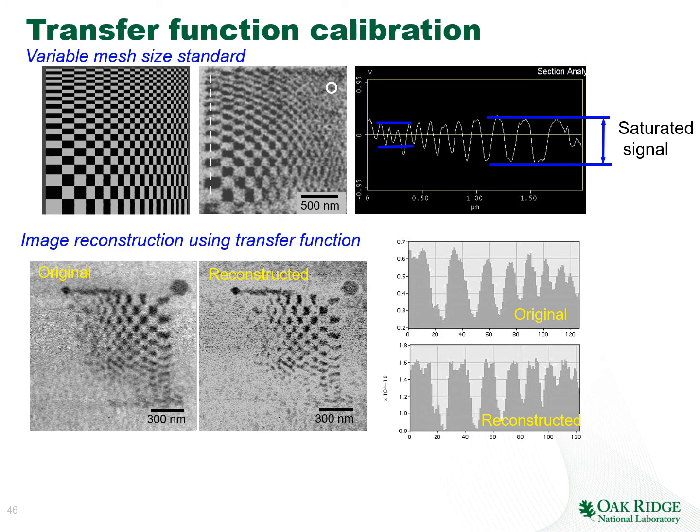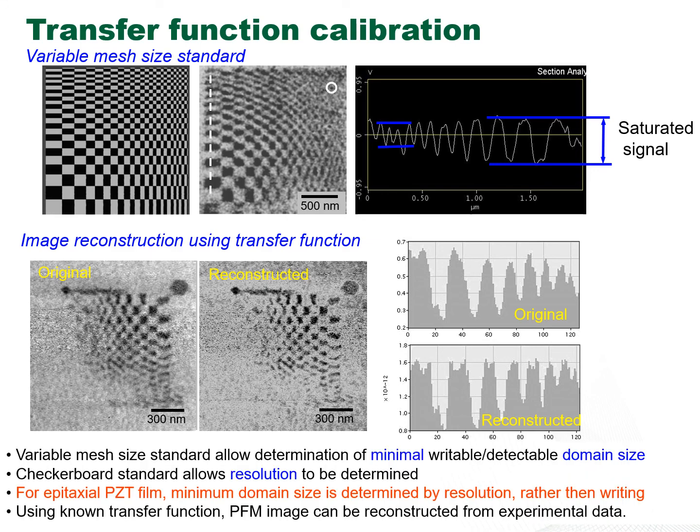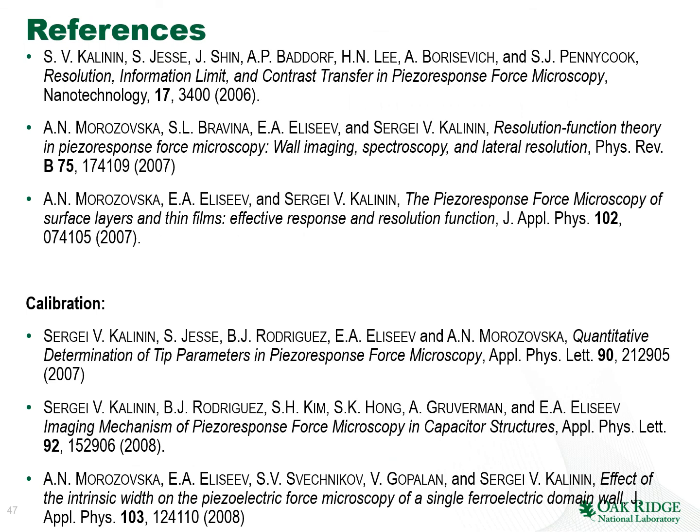And then we can use the regularized reconstruction methods in order to go from the relatively weak experimental signal to a reconstructed signal, which becomes as a result much sharper. So this is the example of how the knowledge of the imaging system can actually improve our data.